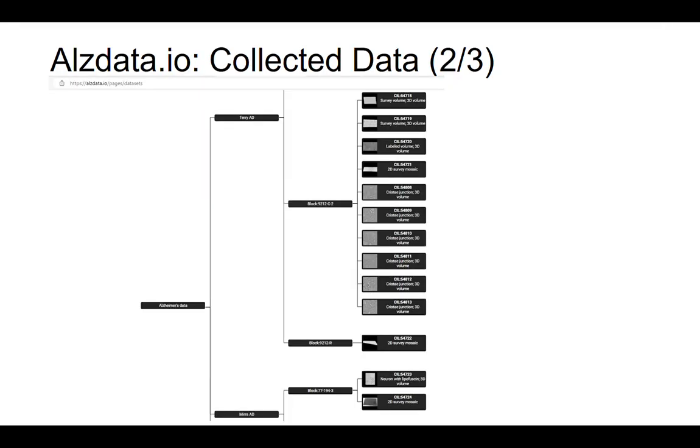In the Hierarchy Viewer, the first level of the tree branches represents the neuropathologist's name, serving as an index for a specific biopsy sample collected or provided by that particular neuropathologist. The legacy samples in our database come from renowned neuropathologists, Doctors Robert Terry and Suzanne Mirra, who collected them in the 1960s and 1980s, respectively. These historical samples serve as a critical foundation for current research into Alzheimer's disease.